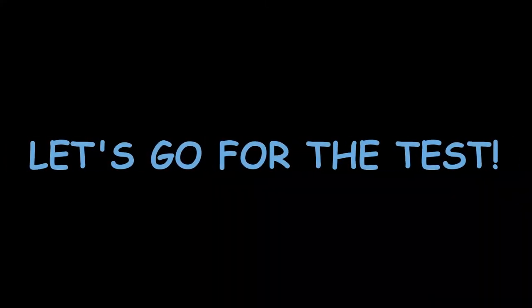So viewers, let's conduct the experiment for DO determination of industrial waste water.